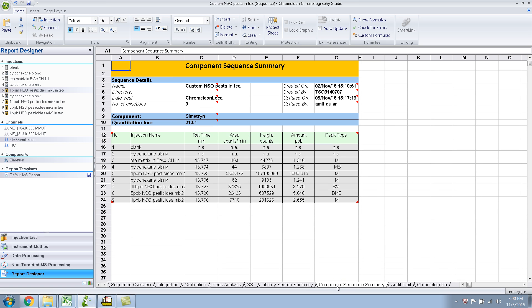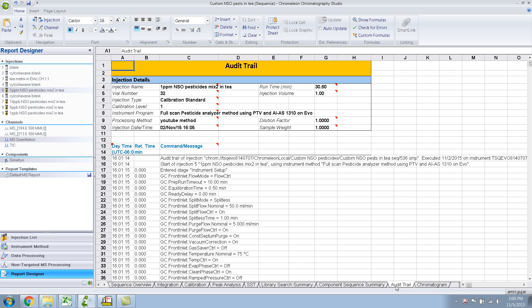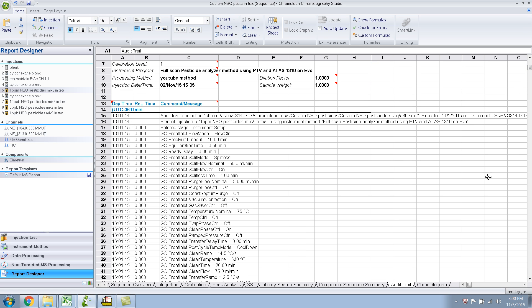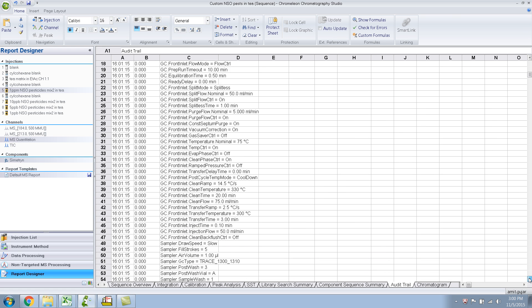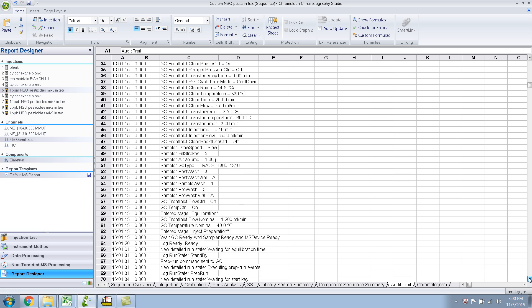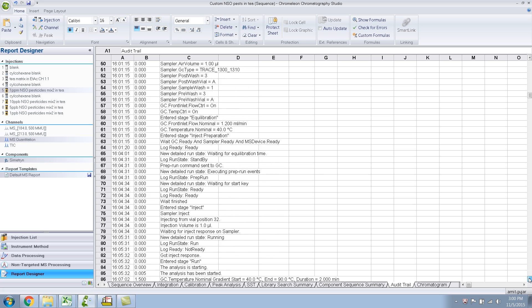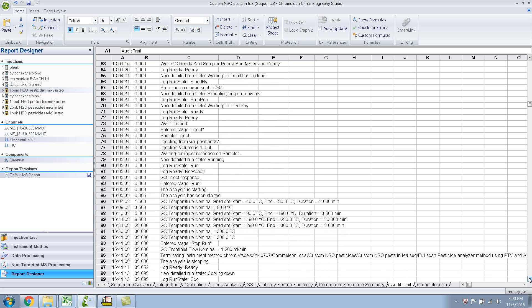What about component sequence summary? Okay, so this is, I mean, the same thing, just like a sequence overview, your areas, heights, amounts. And this is the audit trail. So, I think in some labs, this is of importance to see what went down, basically, what were the GC conditions, and stuff like that.